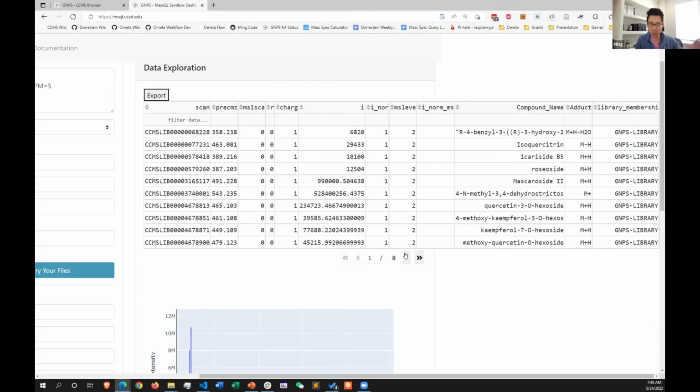And what was interesting, as we're writing the paper, one of the new postdocs at UCSD, she cares about environmental work, and she did some untargeted mass spec looking for this flame retardant molecule. She manually looked through all this untargeted LCMS data, and she published her paper with a couple of new flame retardants. And then she made the data public.